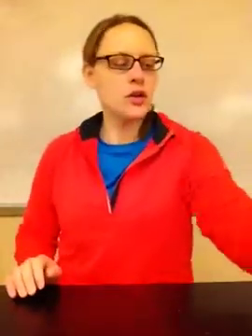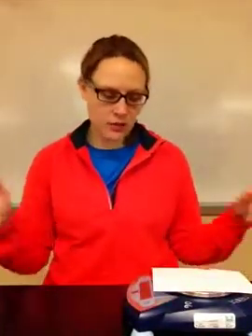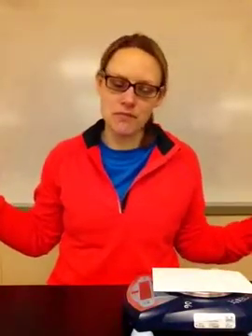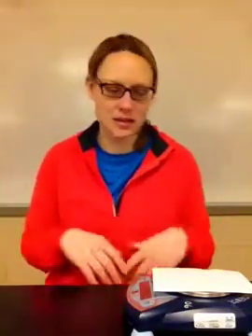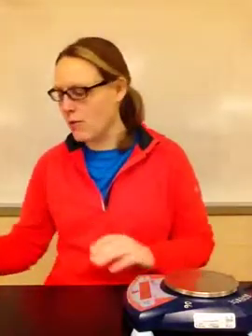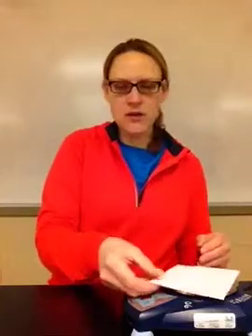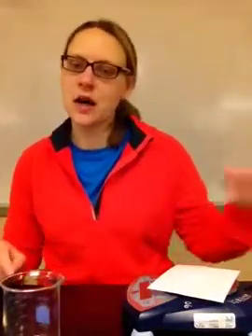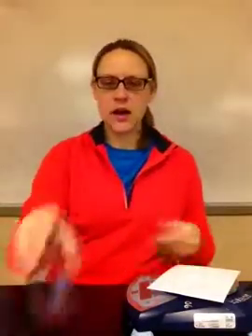Okay, so you're going to get a balance. All right, you're going to get some weigh paper. You're going to make sure when you are using weigh paper, always hit the 0 button. It's a lot easier than trying to figure out the mass of the filter or mass of the weigh paper later, subtracting it, whatever. That's a bunch of extra steps. So you're going to mass them out. You're going to put a bunch of the white solids. So here's one of them. I've already done it. Okay, you're going to figure out whatever mass you calculated. That's how much you're starting with. Okay, so mass out your first reactant.